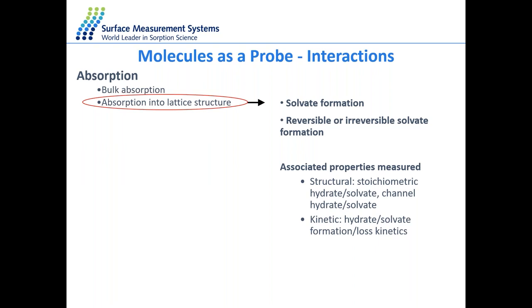The other process that we have to remember is reversibility. Is the hydrate reversible or irreversible? So can we go back to the anhydrous form, or if we can't, in that case, it is irreversible. So we're going to have a look into more detail into these, specifically in the application section.